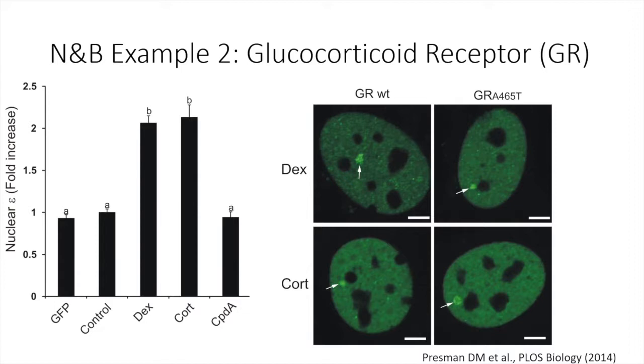And actually, for the dimerization, they can even see more than dimer, such as tetramer or higher order. So number and brightness is a useful technique: not only does it give you the oligomerization, you can also observe the heterogeneity of your sample.